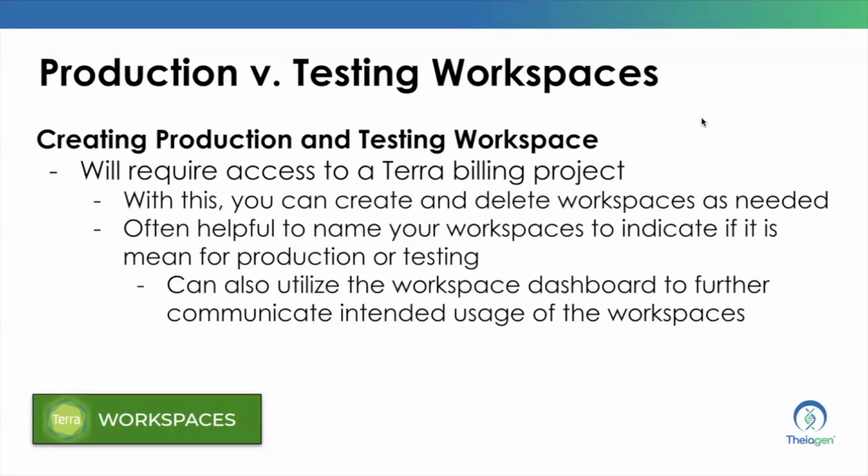In Terra, creating new workspaces, be it for production or testing, will require access to a Terra billing project. With a Terra billing project, users can create and delete workspaces as needed. When creating these workspaces, it's important to name them clearly. For example, adding the term production or testing in the workspace name explicitly can help to clarify its intended purposes. You can also use the workspace dashboard to document its purposes, key resources, and other helpful information.